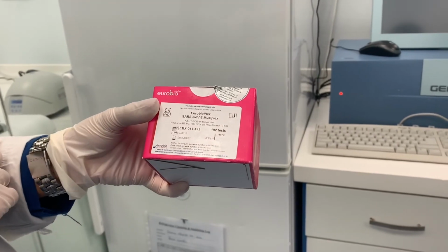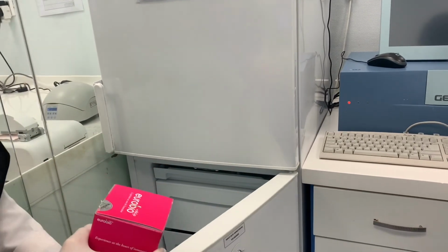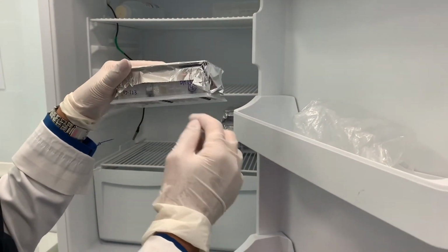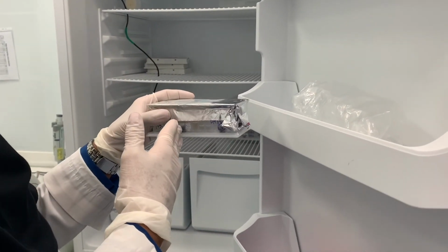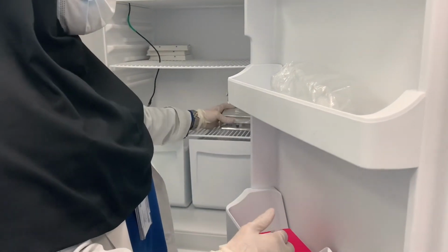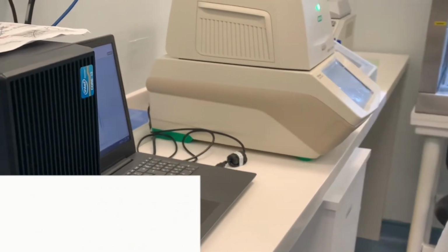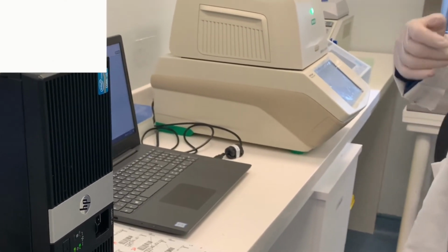This is the kit currently used for SARS-CoV-2. The extraction kit, which we obtained from the previous step, will now be used. And 5 lambdas of this, which contains the extracted RNA of the virus, will be added to a master mix of 20 lambdas. The master mix contains enzymes and other substances. Enzymes such as Taq polymerase and reverse transcriptase, which are obviously required for the RT-PCR process.